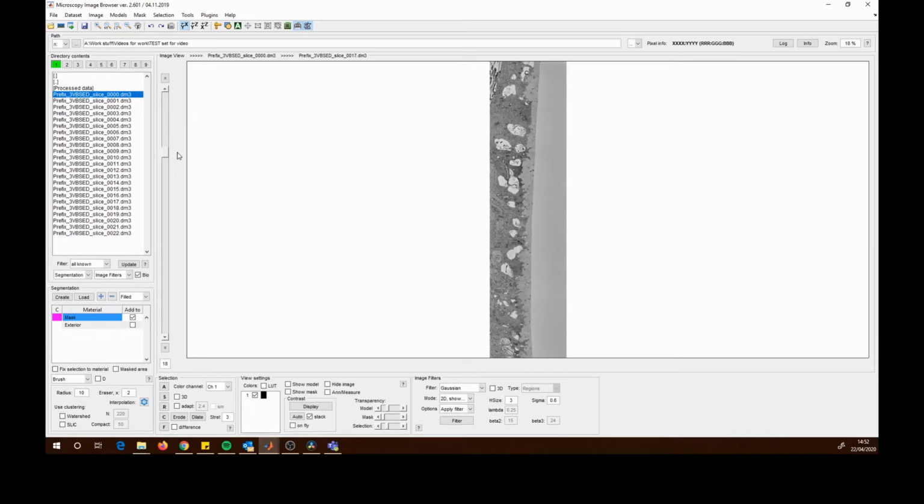So if you're looking at 3D electron microscopy data, like SBF-SEM data, you sometimes get darkening as you go through the dataset. That can be corrected with contrast normalization. We can't see it here because this is not a big dataset, this is quite a small one. However, at the start of the dataset, there is an anomaly here, maybe a cutting artifact or something from when we first started the data.